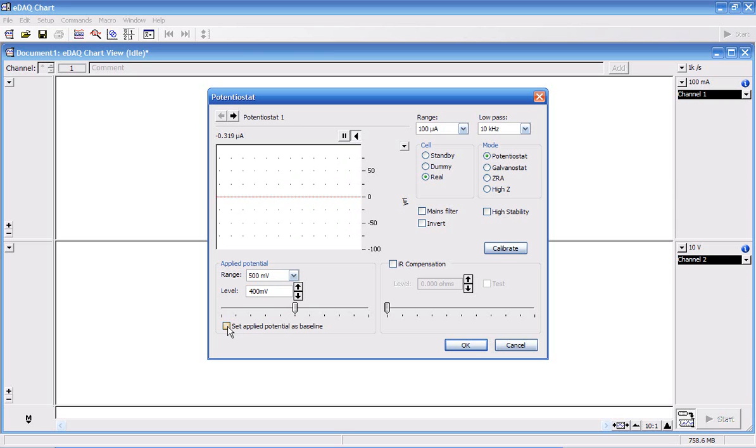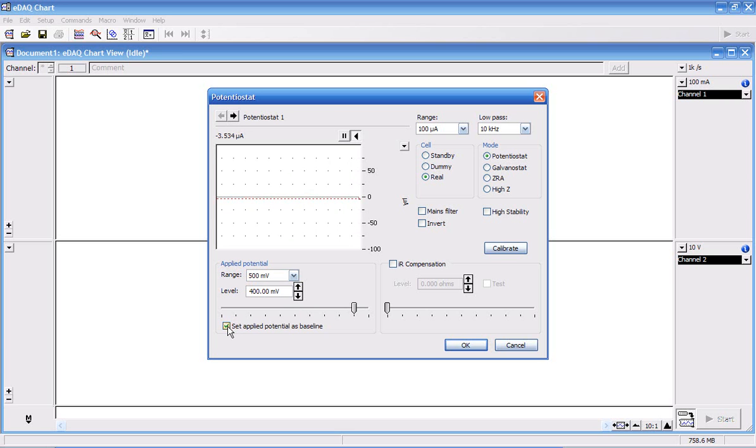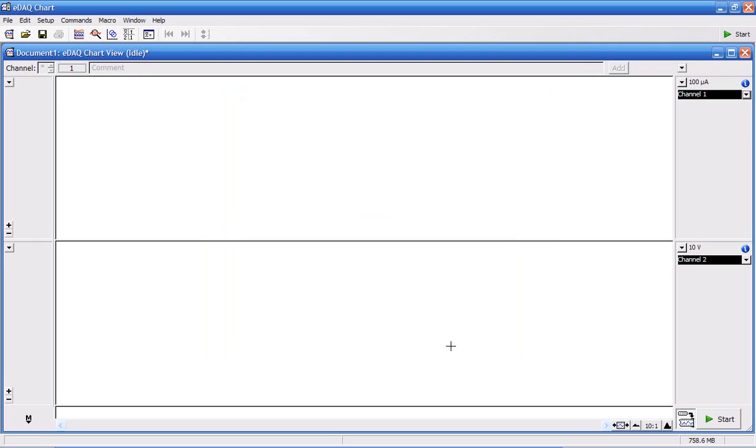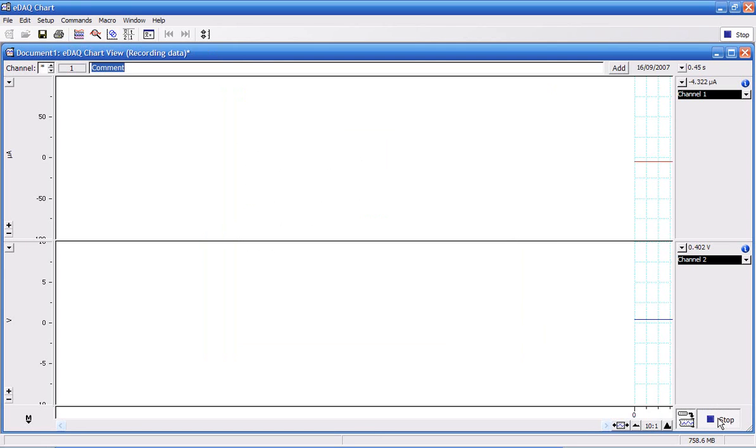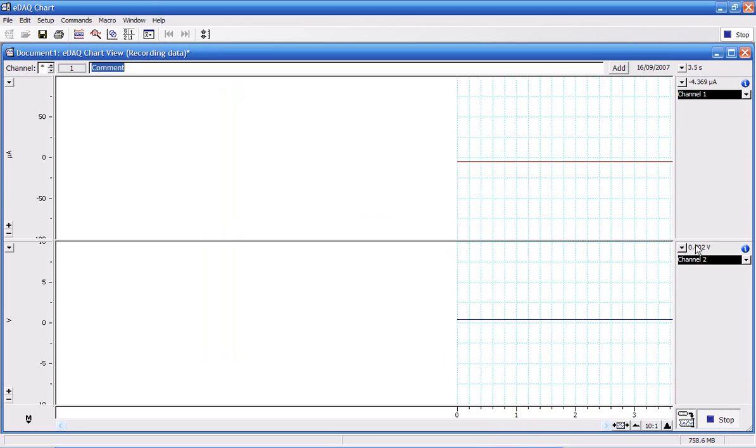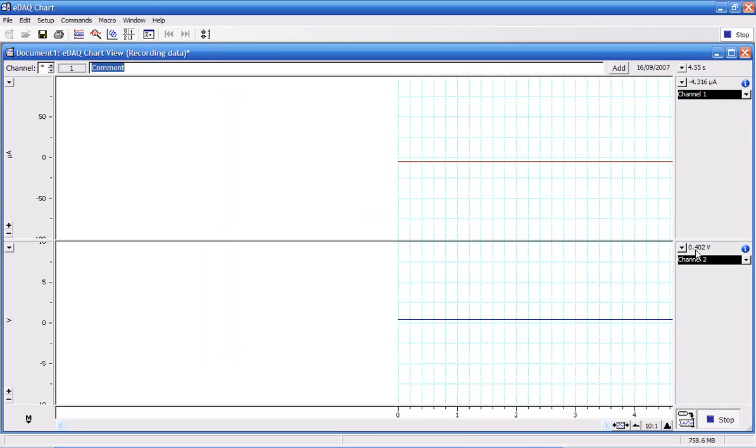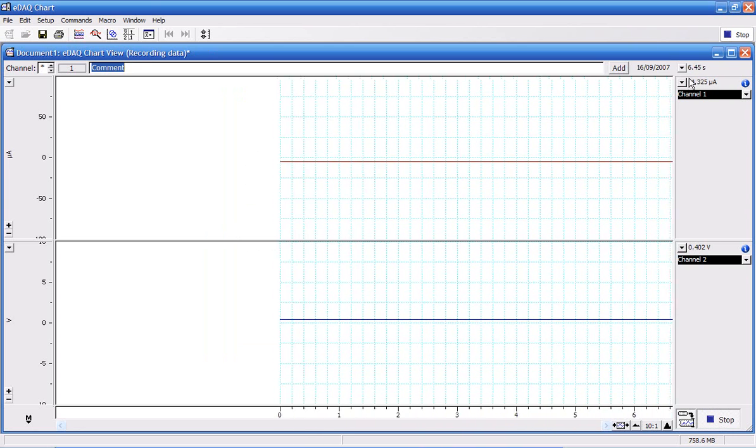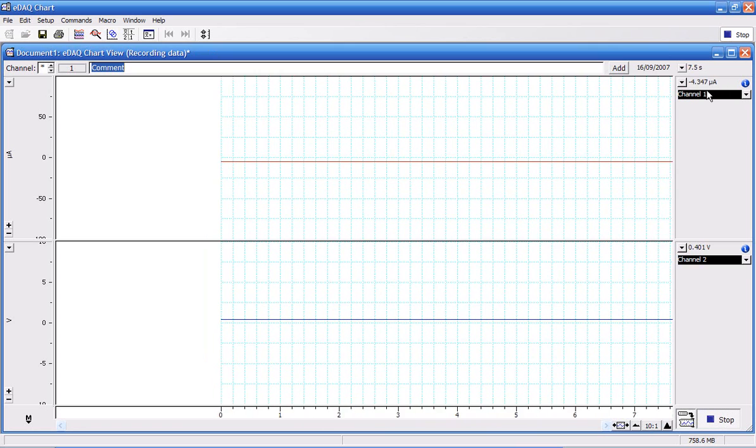You then click here to set the applied voltage as the baseline. And now when I press OK and click on start, that voltage will be applied continually in channel 2. And you're recording in channel 1 the current.